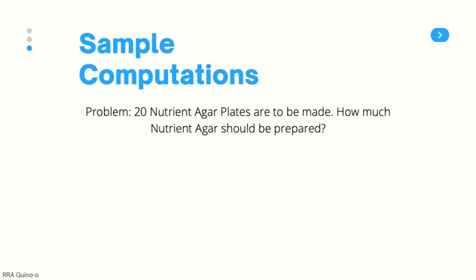So here we have a sample problem. We need 20 nutrient agar plates. So how much nutrient agar should be prepared? I'll give you time to pause here while you find the answer. Were you able to compute it?